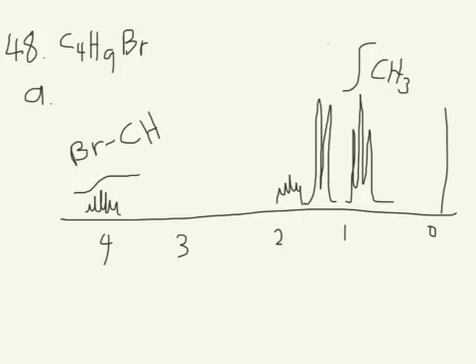And the next question would be, what is it bonded to? A CH, CH2, CH3, and we can tell that by the splitting. Since there are 3 peaks here, this is a triplet. 1, 2, 3. We know that it's bonded to 1 less hydrogen within 3 bonds. So 3 peaks means 3 minus 1 equals 2 hydrogens nearby. And for the moment, that's all we can say about the signal all the way on the right.